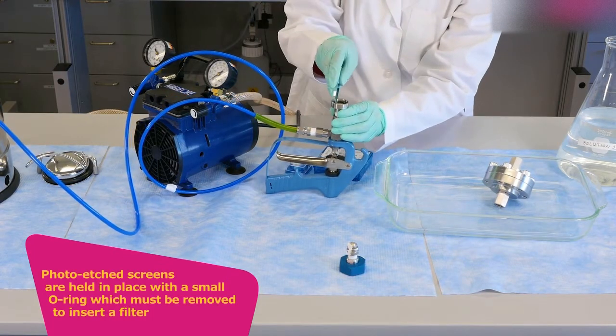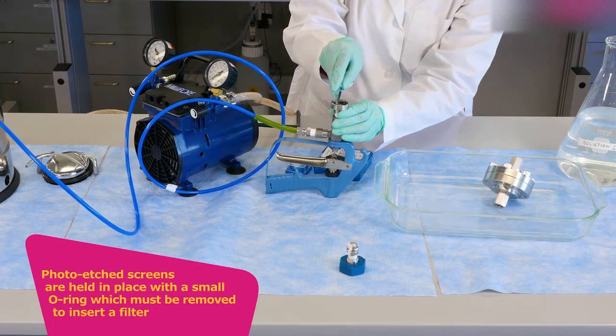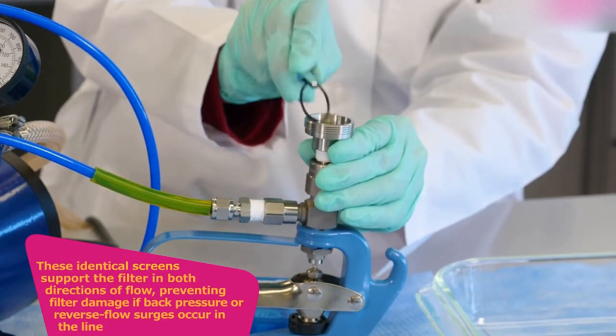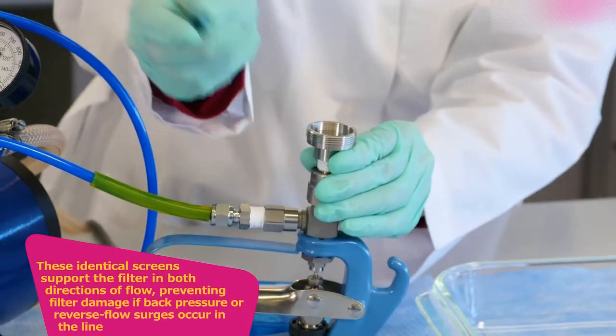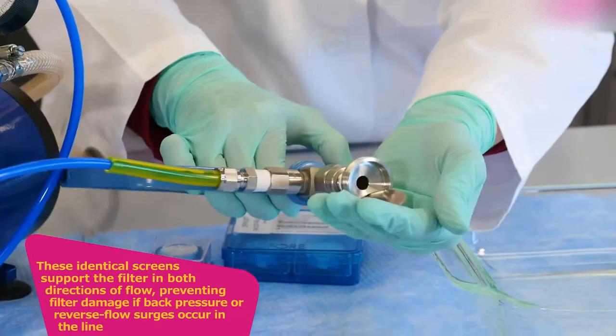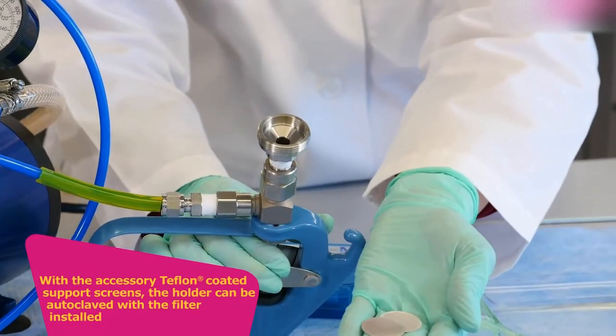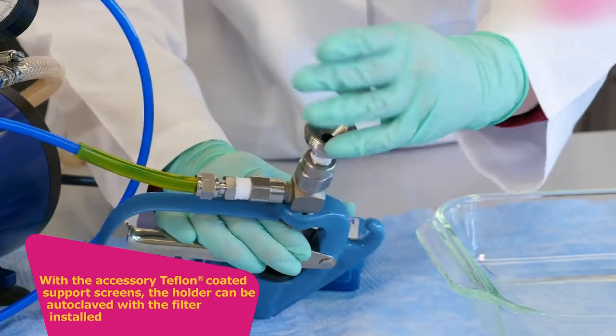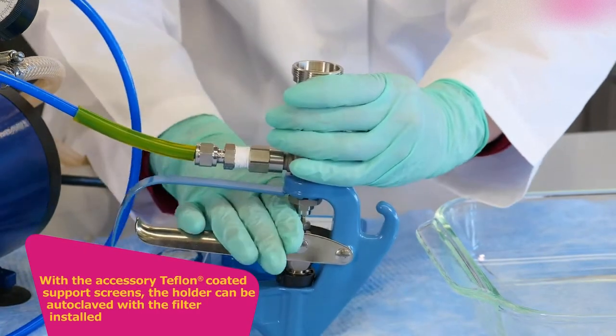Photo etched screens are held in place with a small O-ring, which must be removed to insert a filter. These identical screens support the filter in both directions of flow, preventing filter damage if back pressure or reverse flow surges occur in the line. With the accessory Teflon-coated support screens, the holder can be autoclaved with a filter installed.